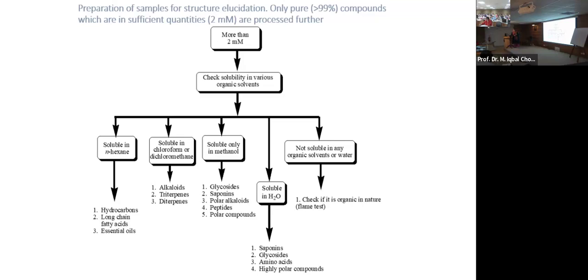But definitely, as I said, there are many deuterated solvents available commercially. We have the most common ones in the facility for students. If you would like to have any specific one, you can request your supervisor to purchase it, and then you can use that particular solvent in the NMR lab. Deuterated solvents are extremely expensive, and they are getting more and more expensive.